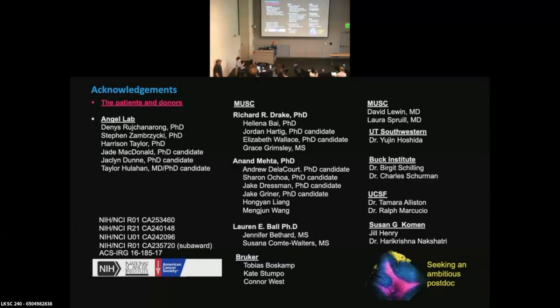So we do have some great mass spectrometrists that are actually in the surgical suite. For these preparations, they would be probably similar to what a pathologist would do, take them out of the surgical suite and prepare them with immunohistochemistry-like workflows. The time to doing that is really dependent on the right conditions. And I think that we're really close to being able to do that. There's a lot more interest in doing this now. So maybe within the next 2 years, someone will make that breakthrough. Great. Okay, thank you.